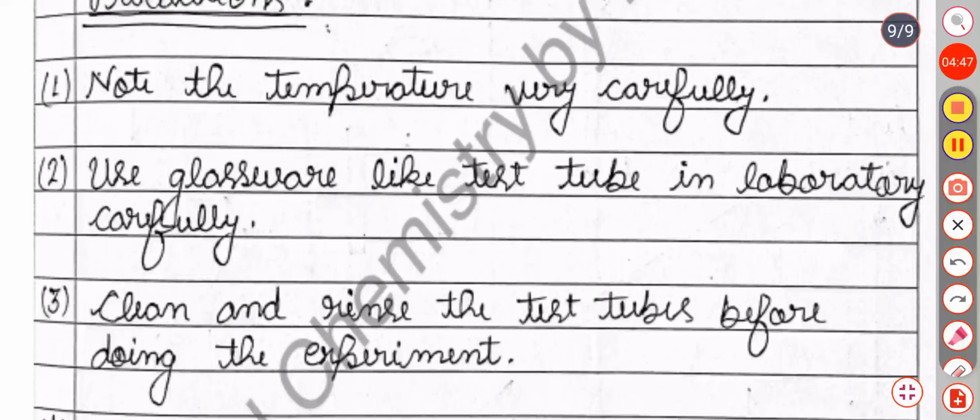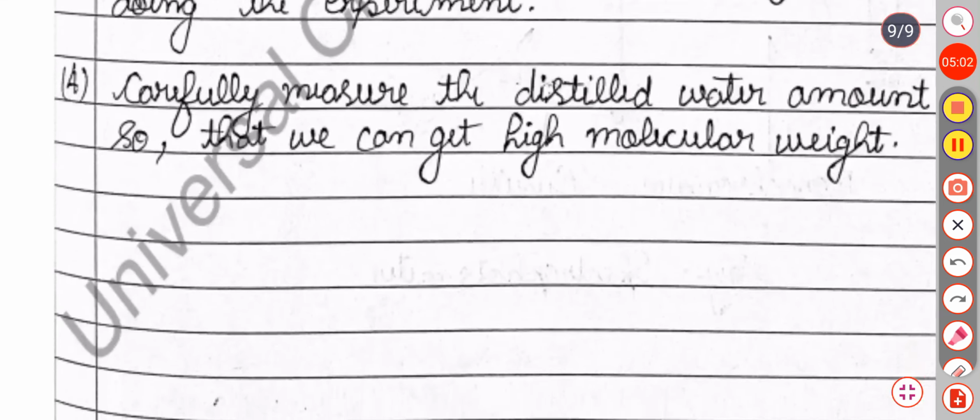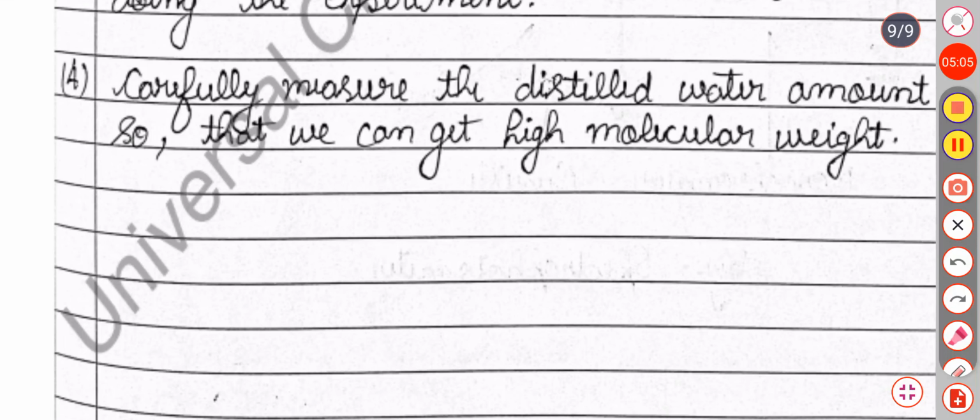Precautions. Note the temperature very carefully. Use glassware like test tube in laboratory carefully. Clean and rinse the test tube before doing the experiment, and carefully measure the distilled water amount so that we can get a high molecular weight.